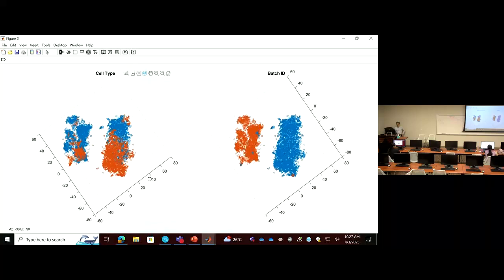So if we decide to go with this blue fibroblast, you will have this group against this group, which is between two samples. I think that's enough to do the analysis. So I'm going to extract fibroblasts to compare between these two samples, okay?